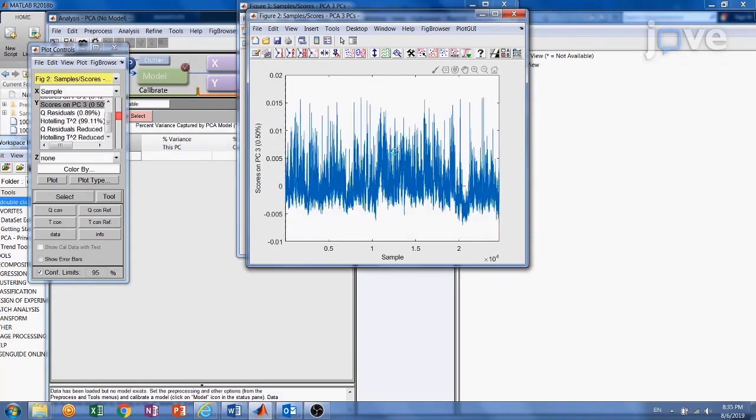During the data analysis, a key challenge is the removal of the outliers and identification of the number of the key components in the dataset. The approach shown in this video leverages our prior knowledge of the clinical dataset and the chemometrics approach to successfully extract the water, protein, and the lipid with depth resolution.